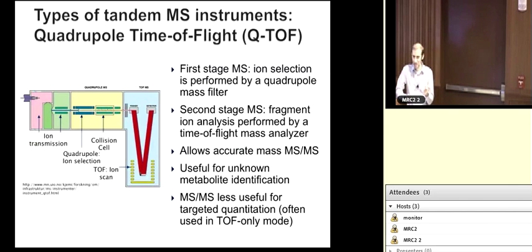So what we would recommend is that you talk to us, or whoever you do your metabolomics with, and establish a plan to allow cross-platform comparisons. A lot of the time, the best thing you can do is generate a pooled sample that is run consistently across multiple platforms, and that data will be acquired every time you run an analysis, serving as a frame of reference by which different methods and platforms can be compared. You can look for the same identified metabolites, or even the same unidentified metabolites based on their mass, across platforms, and you can correlate them and bring them up to the same level if necessary. I've lately worked a lot more, not so much across multiple sites, but across samples acquired over a long period of time, bringing them to the same level and normalizing. As long as the initial analysis is done appropriately, there are better and better techniques available for doing that.